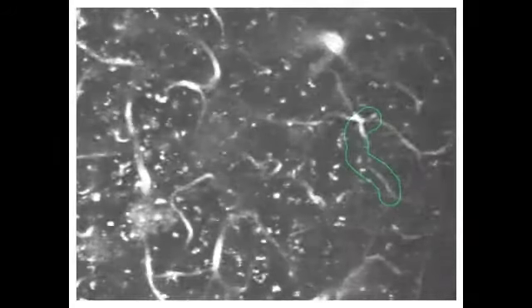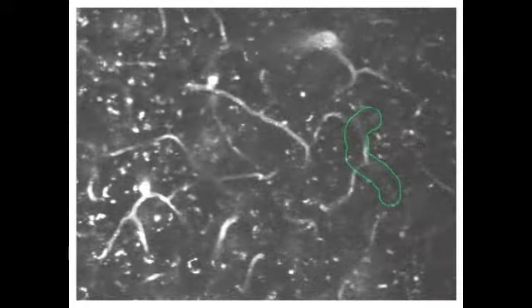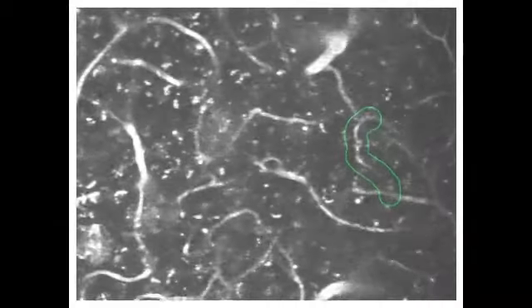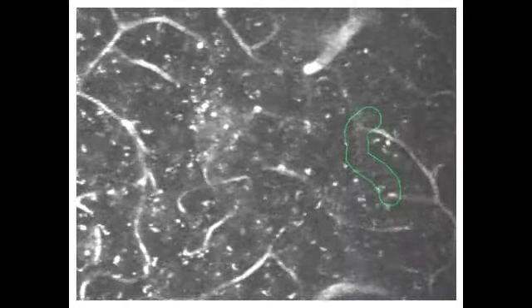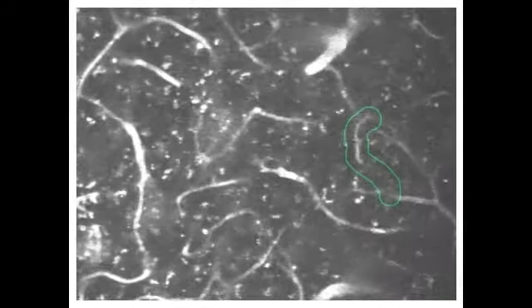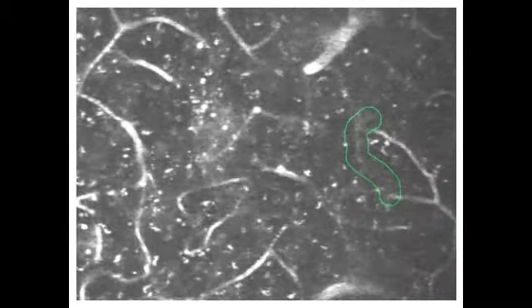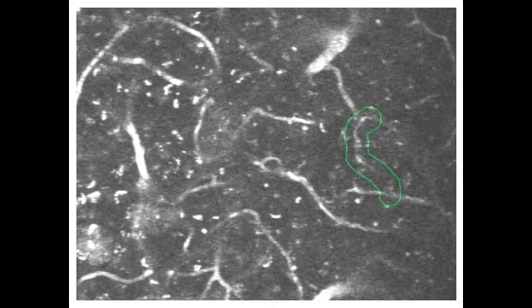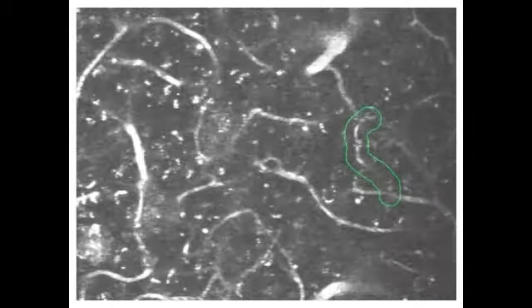Here we have a movie with some graininess and motion artifacts due to natural movement, because these are live images of a mouse brain. We do post-processing to remove motion artifacts, but in this case the motion from breathing or the heart beating of the animal has not been removed. We'll ignore that and pay attention just to the vessel inside the green outline. As we scroll back and forth, it looks like there is motion and there are no black spots that appear to be stuck. So this is considered flowing.